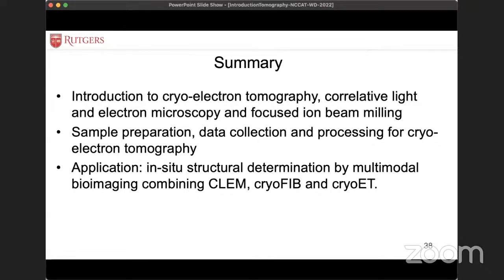And the second question is, since one collects only tilts of images, how many images should be collected to cover the entire Fourier space, or how much does the model suffer from the preferred orientation of the particles, since you only collect at a certain angle or a certain amount of images?